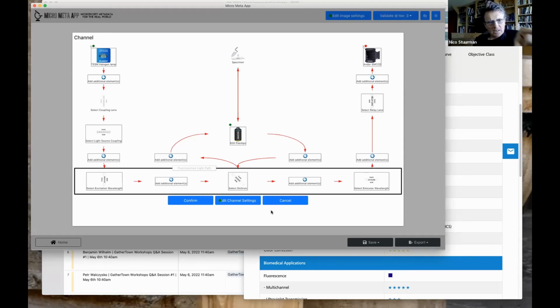Yeah, here in this specific case, my inclination would be to, at the very least, have these channels predefined for people. The channels are going to come in automatically from the Bio-Formats file. So in this case, I just showed you an example that is not really a great use case, because it does come in from Bio-Formats, and as much as possible that we can find in Bio-Formats is pre-filled.